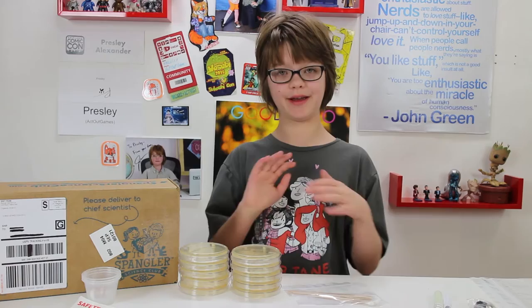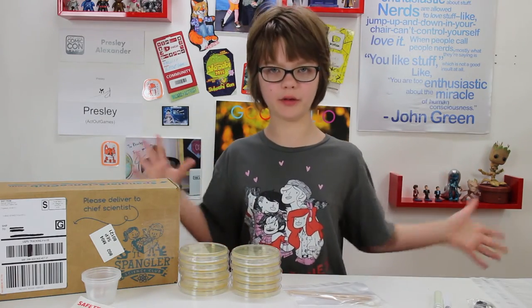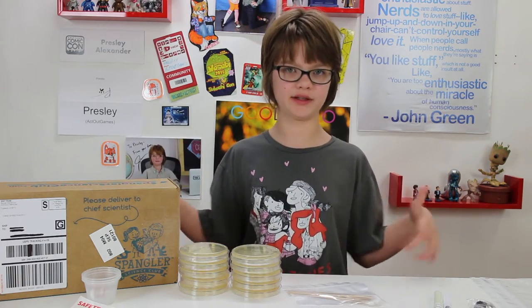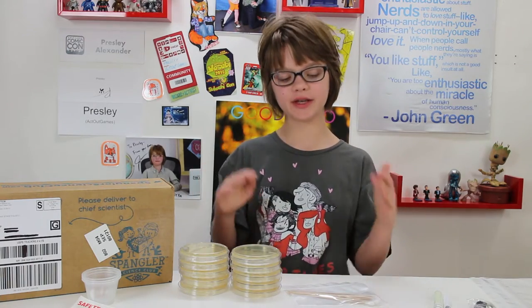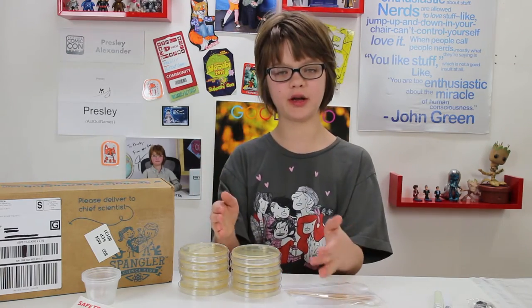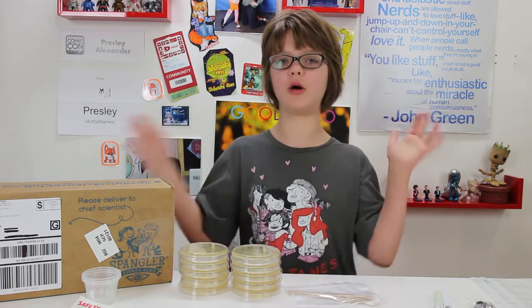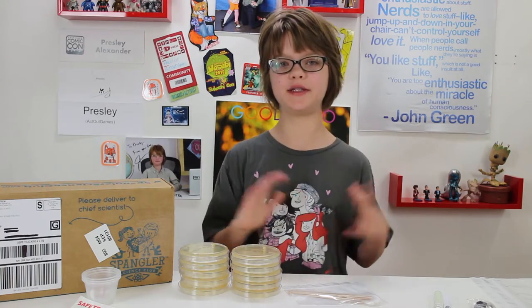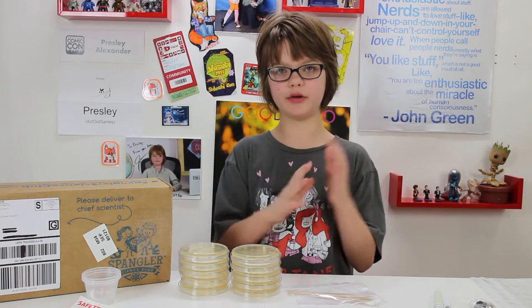As always, there is a ton of stuff, and we're only going to be showing you a few of the really cool things. Just start getting the kits if you want to be able to do all of the really amazing stuff. So we're going to be taking swabs from four different things around the house, growing the bacteria in four different petri dishes, cleaning all of those things in different ways, and then growing them again to see how much of a difference cleaning makes.